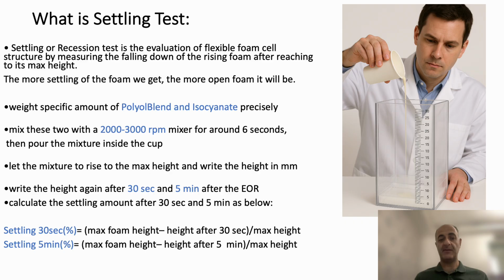Then he lets the mixture rise to the maximum height, and at that point he writes the height in millimeters.